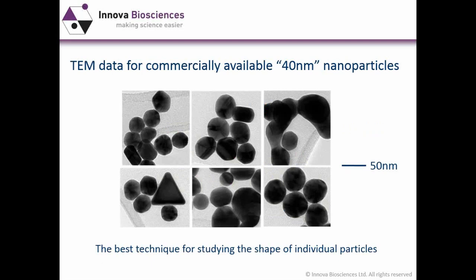Okay, the different shades can be explained in terms of different shapes. The interaction with the light is altered when the shape of the particle is changed. So here we have transmission electron micrographs of the various samples of gold nanoparticles. You can see in the bottom right corner some spherical particles, and there are other shapes and sizes. In the bottom left you can see a triangular structure, and if you look around the slide you can see rods and some hexagonal particles as well. And in the top right you have this structure, which looks to be a fusion of maybe 5 or 6 nanoparticles.